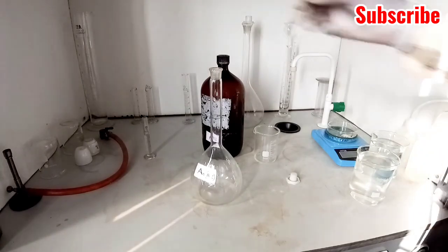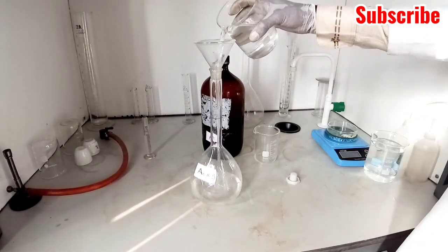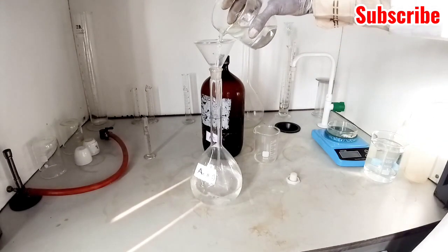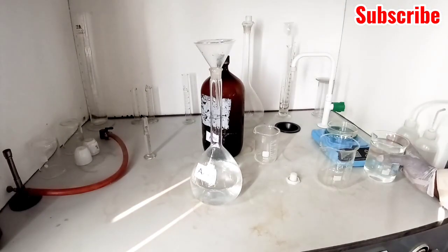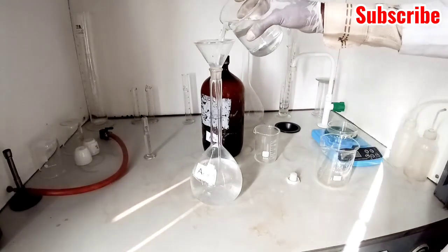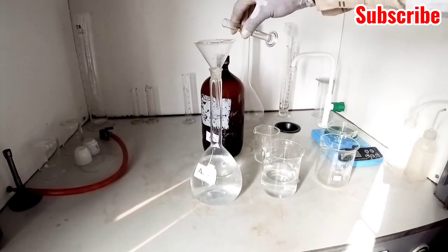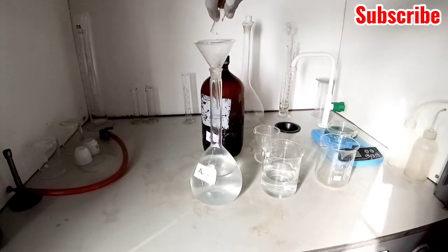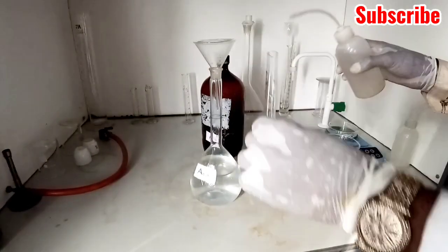And here is a standard volumetric flask, 1000 ml capacity. First, you pour a little water into it. Take note, you add acid to water, so that is why we're adding water to the standard volumetric flask first. Then you can add your acid, the 8.5 cm cube, and dilute to the 1000 mark.